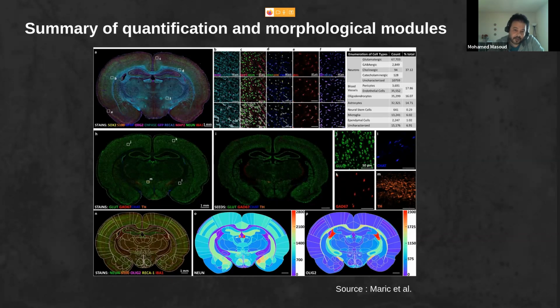And they make a quantification for all these types and subtypes, as we can see on the table on the upper right hand. This is showing the different cells that they had in this section.